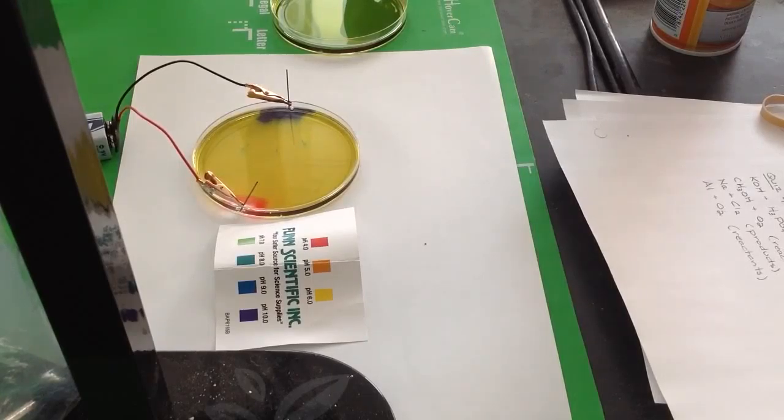So with an electric current going through this, what are we doing to the water? It has nothing to do with the lead. The lead is just an electrode. So what happens is what's in here is H2O, H2O liquid. And we're supplying this thing with a current. Now think about what water will do.